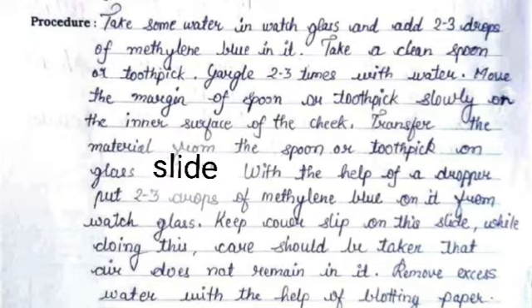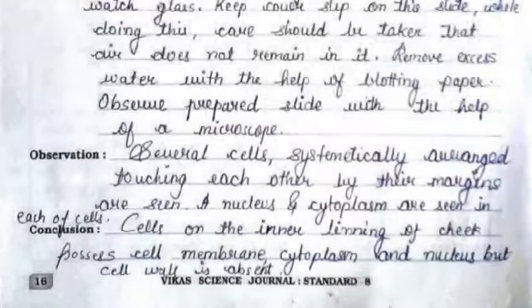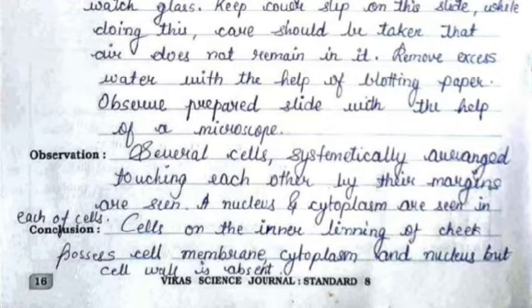Keep a cover slip on this slide. While doing this, care should be taken that air does not remain in it. Remove excess water with the help of blotting paper. Observe the prepared slide with the help of a microscope.